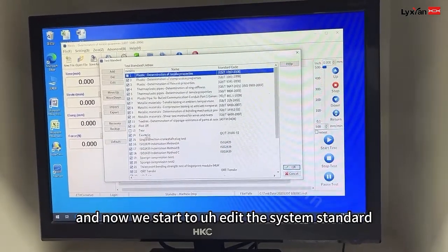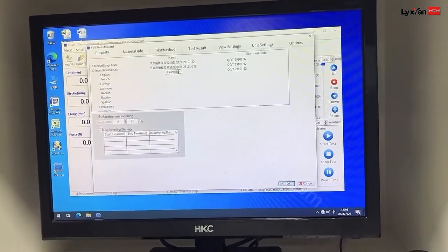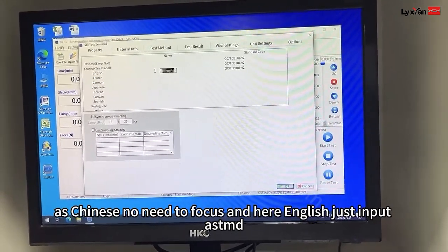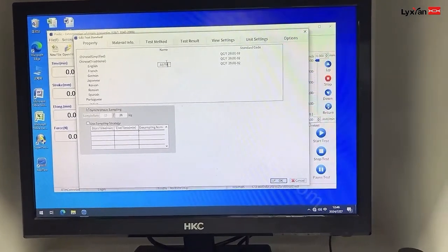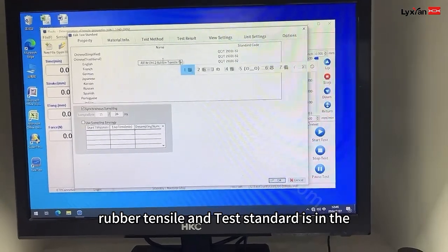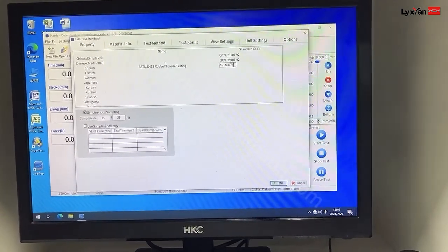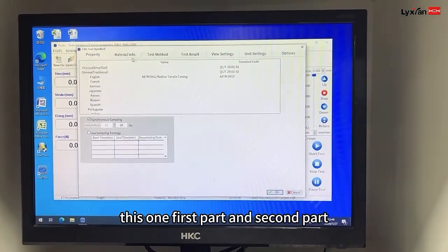Now we start to edit the tester standard. For the Chinese interface, we don't need to focus. Here in English, just input ASTM D412, rubber, tensile, testing. And the tester standard: ASTM D412. Okay, this was the first part.